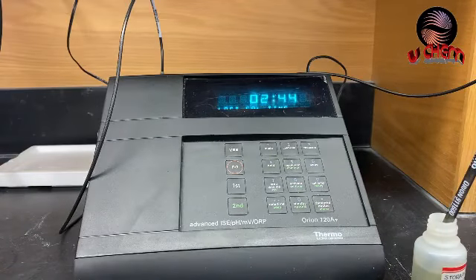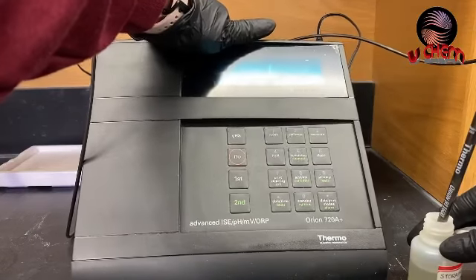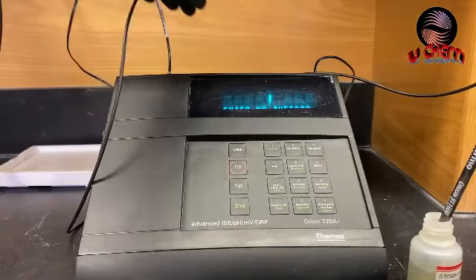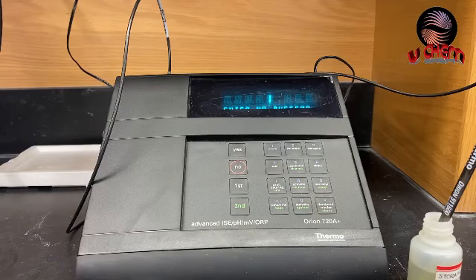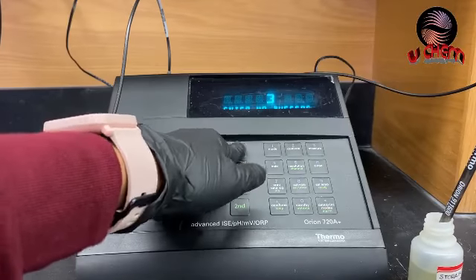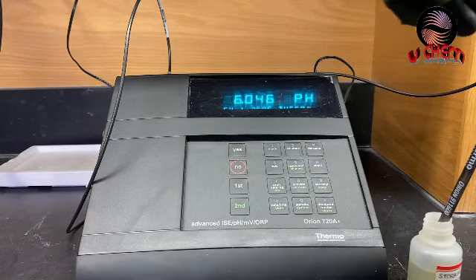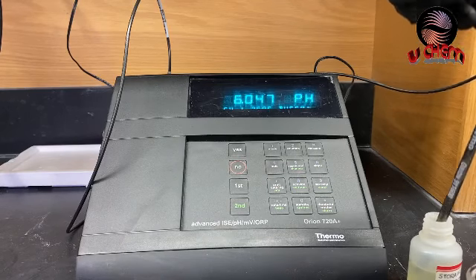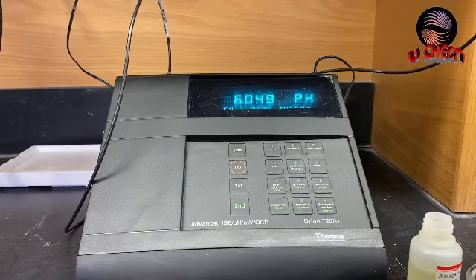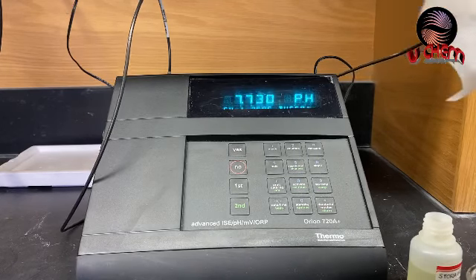The meter shows the time and date of the last calibration, and then it asks for the number of buffers. As I said, I'm going to use a three-point calibration, so I'll put in three and hit yes. Now you need to wash the probe — clean it with a little bit of water, then use chem wipes and dry it out carefully.